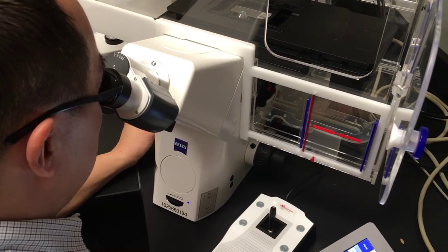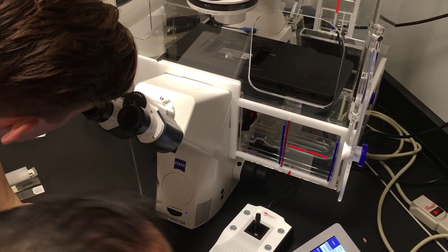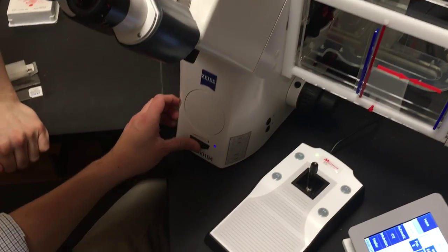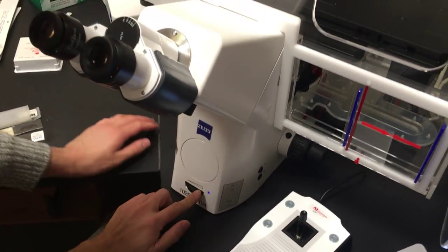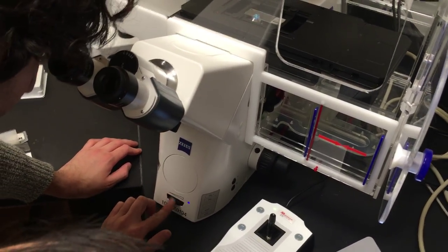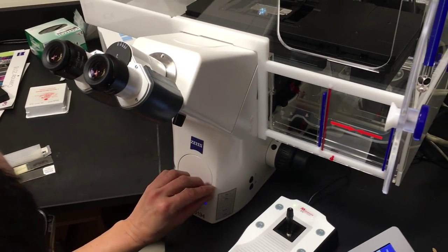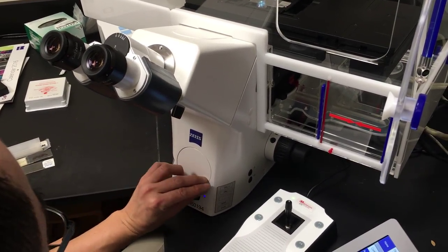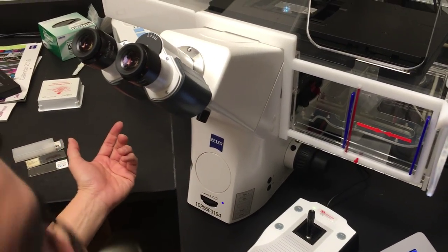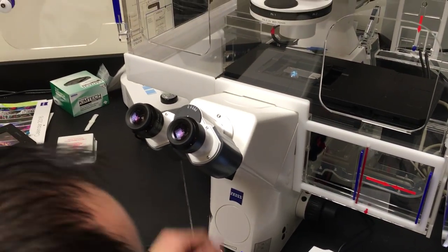I'm seeing some cells in phase 1. You can increase or decrease the bright field intensity here—brighter, less bright. It may not be a bad idea to put a little sticky here saying 'bright field or phase intensity.' I've seen people do that; it helps.